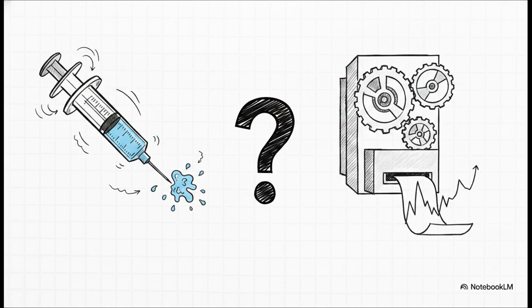Okay, so we've got our basic equation, right? But as any of us who've spent time in a lab know, the physical world is messy. We absolutely cannot just trust the math blindly because we run into 2 huge hurdles. First up, to even calculate our kx decoder ring, we have to know the exact injected quantity. But getting a perfectly precise injected volume is nearly impossible. We're dealing with microscopic amounts here, and there are strict mechanical limits to the precision of syringes and injection loops. Second, like we just talked about, kx is constantly shifting with instrument tuning. Instrument drift is a very real thing. So if our injected volume is always slightly off and our decoder ring keeps changing, how in the world do we get an accurate measurement?